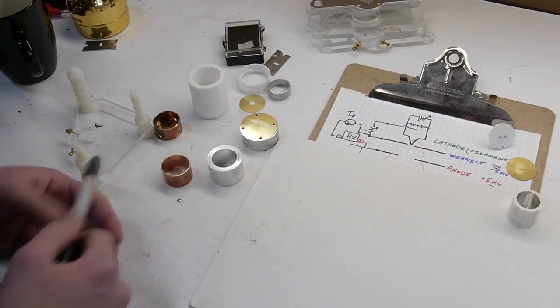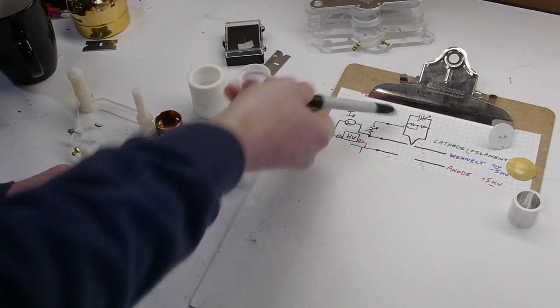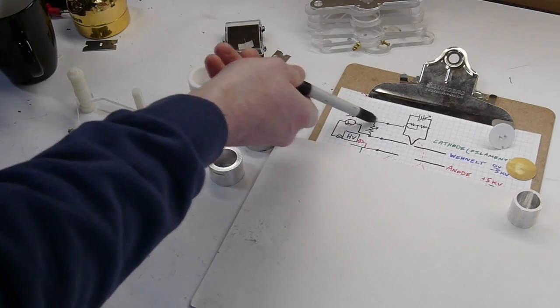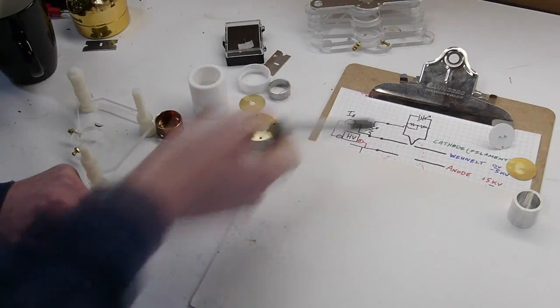And then there's a couple of balancing resistors just so that current flowing into this little circuit here is balanced to both legs of the filament and another variable resistor, a current meter.